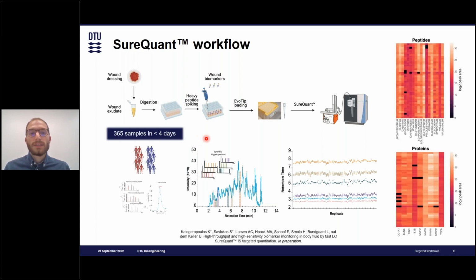And of course, we had a very complete data set. We were able to acquire data for most of the samples and most of our peptides. Here you can see the curated peaks. So these are actual peaks. There's no noise level; everything that's noise level, we remove. And I'm just showing a subset of the data, 6 patients, but we were able to have very high data completeness.